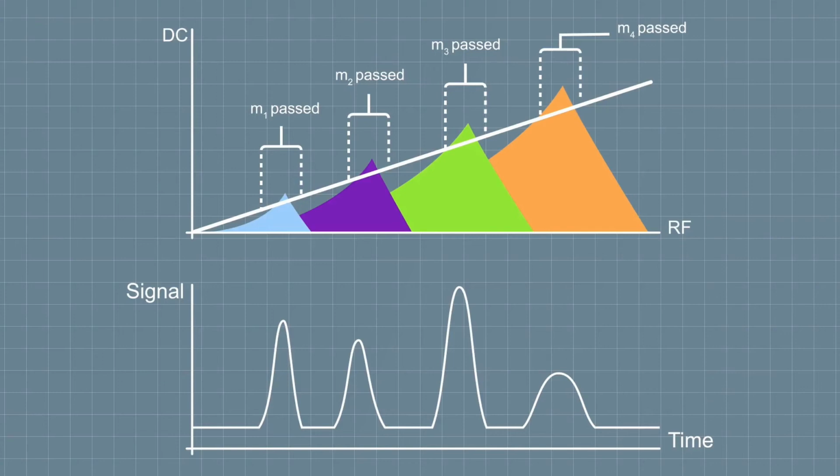We don't need resolution because our information is coming from the fragmentation pattern. Now, we have to be really careful and make sure that we have pure compound coming through because our resolution isn't good enough to distinguish between peaks that are close together. When you have a bunch of fragments, a big messy spectrum, if you have a mixture, you're going to get peaks pushed together. So we have to make sure this stuff is pure when it goes into the mass spectrometer, but that's not a problem in a GCMS because the GC purifies it for us.